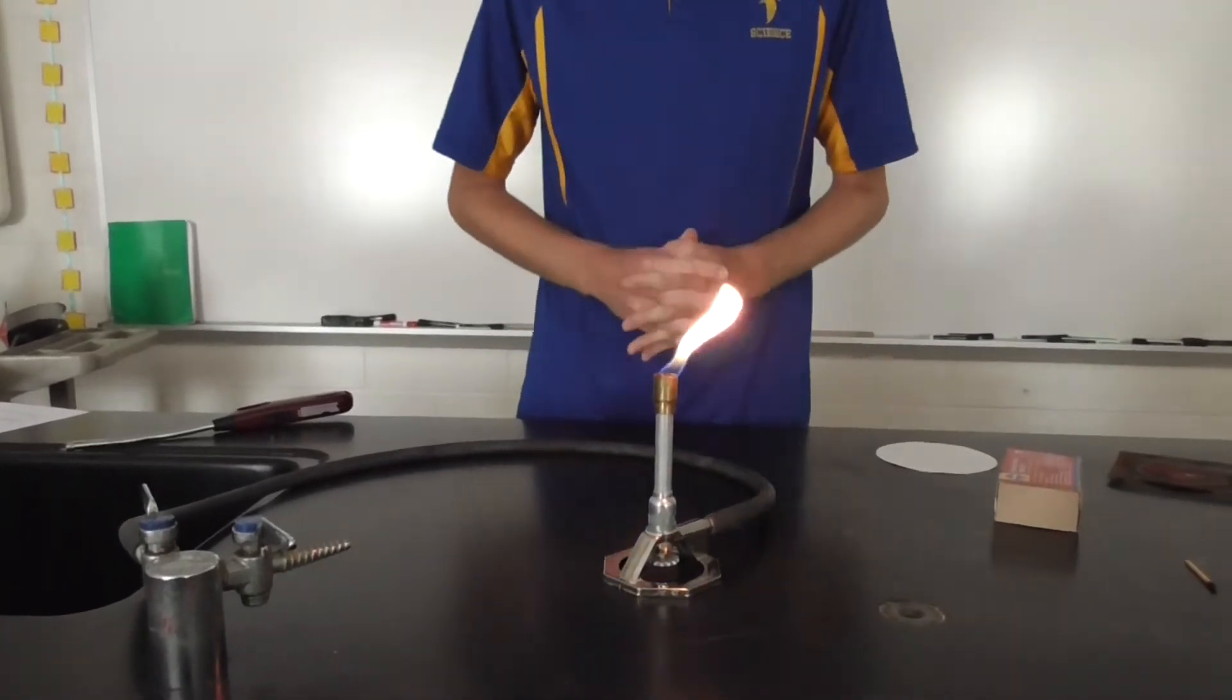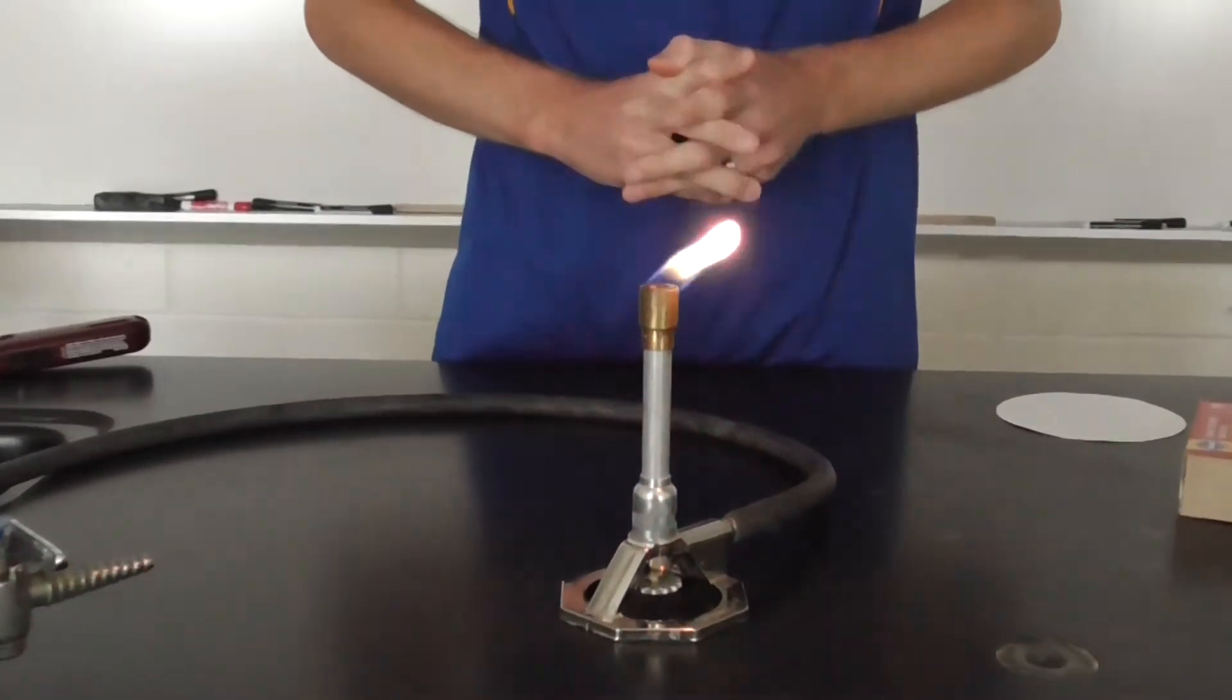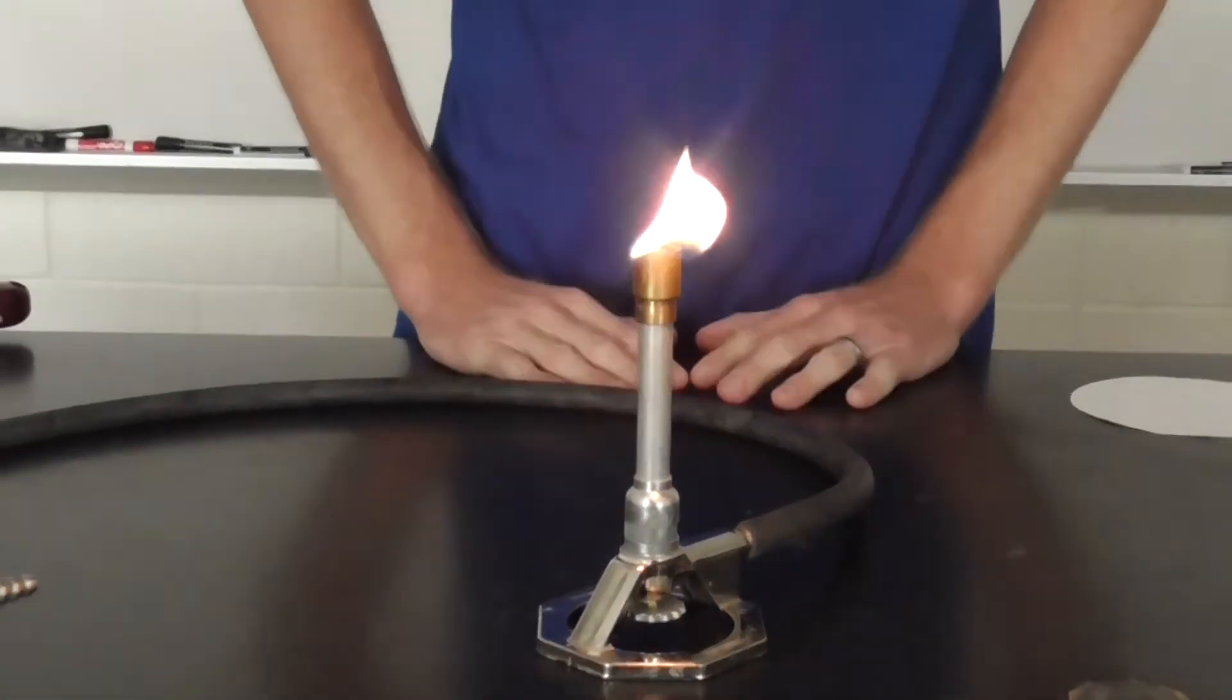Now this is a yellow flame, which is something we're usually not interested in. Usually we want to produce a flame that's blue, that has both an inner cone and an outer cone.